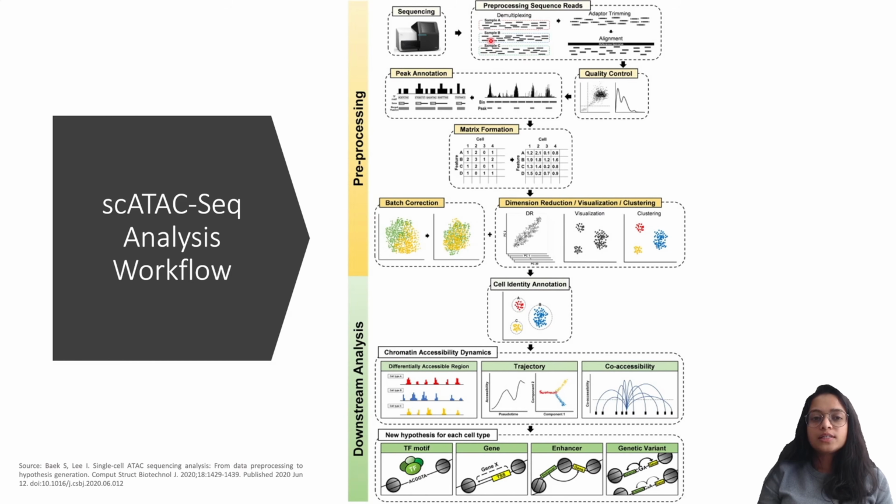So once the reads are demultiplexed, we perform adapter trimming, getting rid of adapters. We perform some additional quality control. We perform the alignment, and we perform post alignment QC to make sure that we retain high quality alignments. All of these steps are pretty much standard for any high throughput sequencing analysis pipeline.